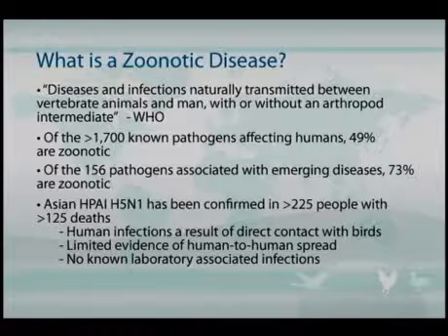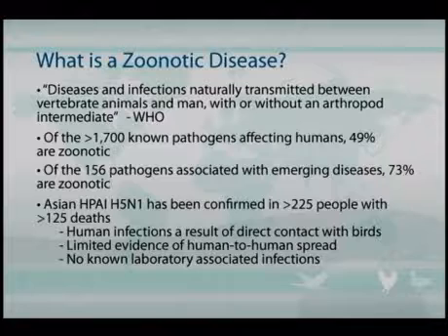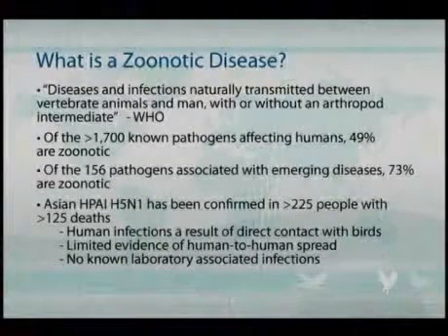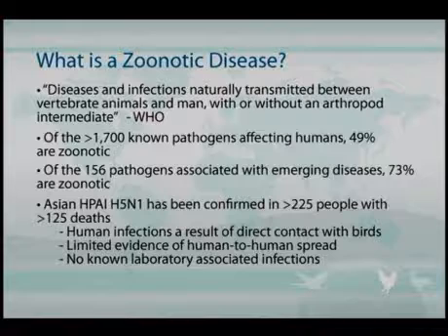And that has now been confirmed in over 225 people, and of those more than 125 have died following the infection. So there's a very high case fatality rate, which means that we, when working with these potential diagnostic samples in the laboratory, have to take very high-level precaution to make sure that we protect ourselves from exposure and certainly infection.